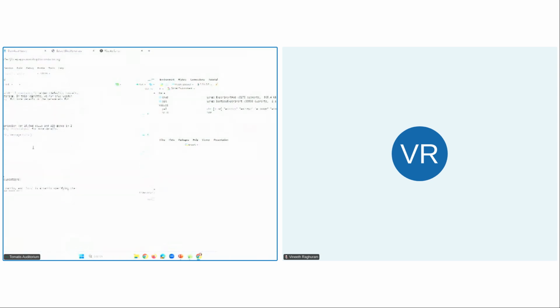We'll be working with a dataset that's attached with the Banksy package. It's a hippocampus dataset comprising about 10K cells across 120 genes, so pretty small by today's standards. I'm just going to load some packages here. The data looks like this, which should be pretty familiar to everyone: a gene-cell matrix and then a matrix of locations corresponding to the cell centroids. And then we create our spatial experiment.